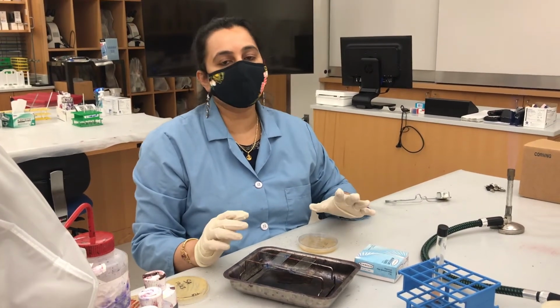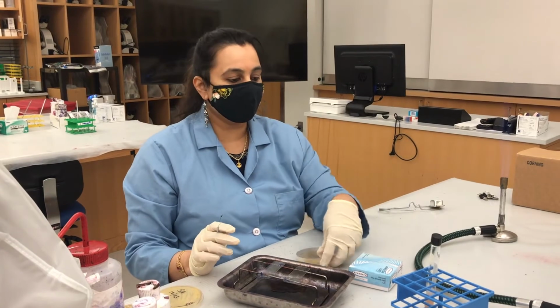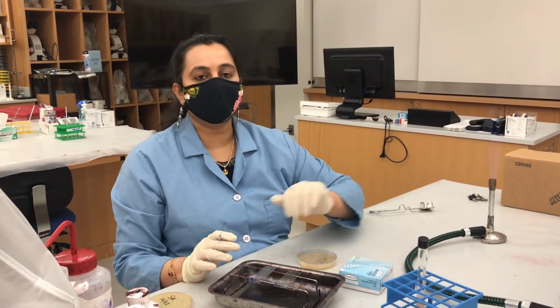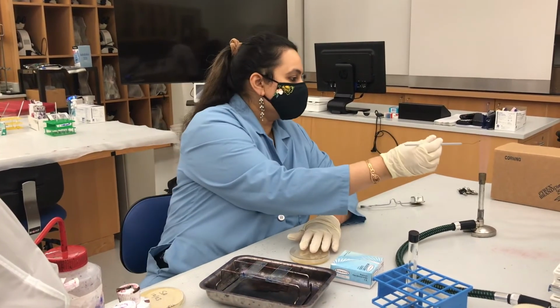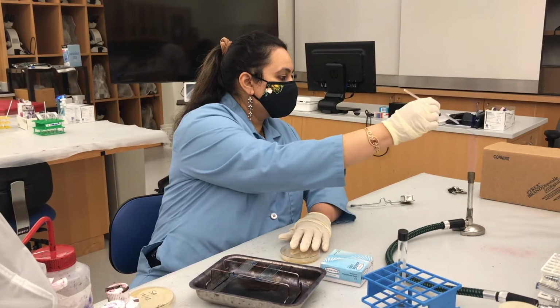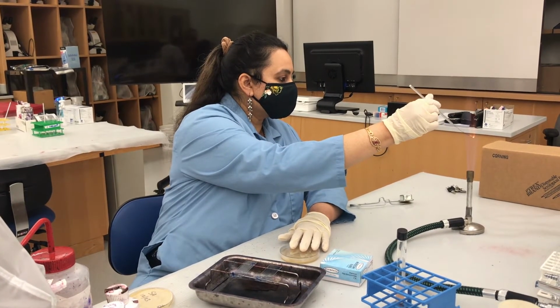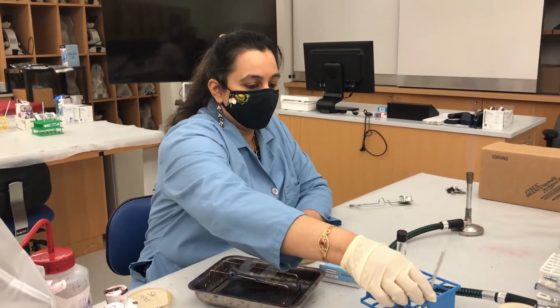So this is the difference between when you're doing gram staining technique using a solid culture versus liquid culture. You don't need to add water when you're handling the liquid, because it's already in the broth. Alright, so let me just sterilize it. Put it here.